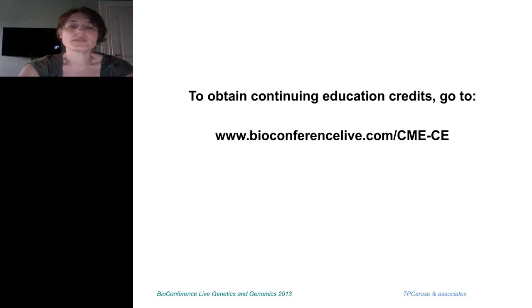So I would recommend talking to the labs that are running next-gen sequencing. In Toronto there is a core lab, and they are a CLIA certified lab, so all of their instrumentation would be certified.